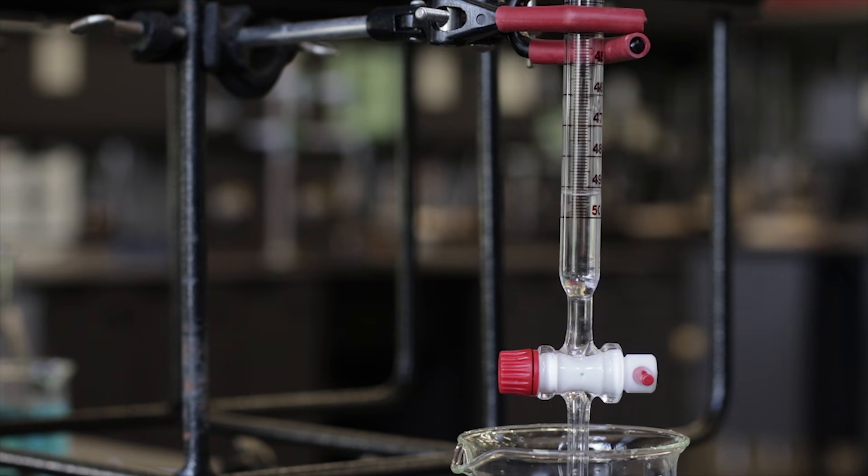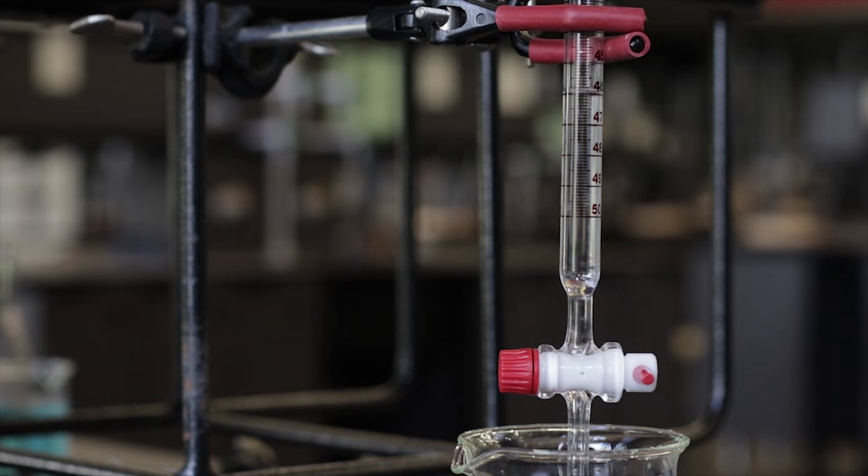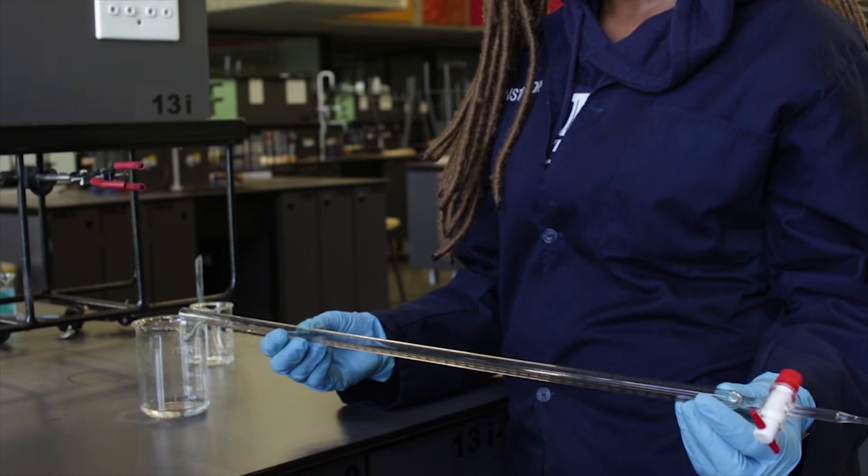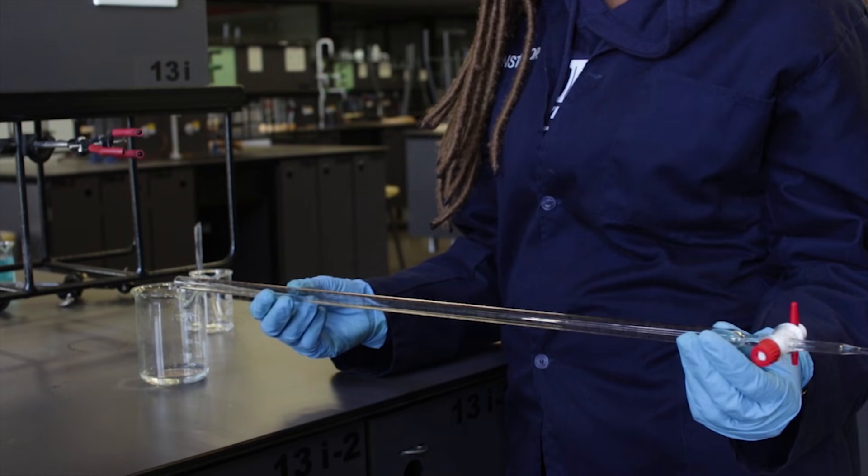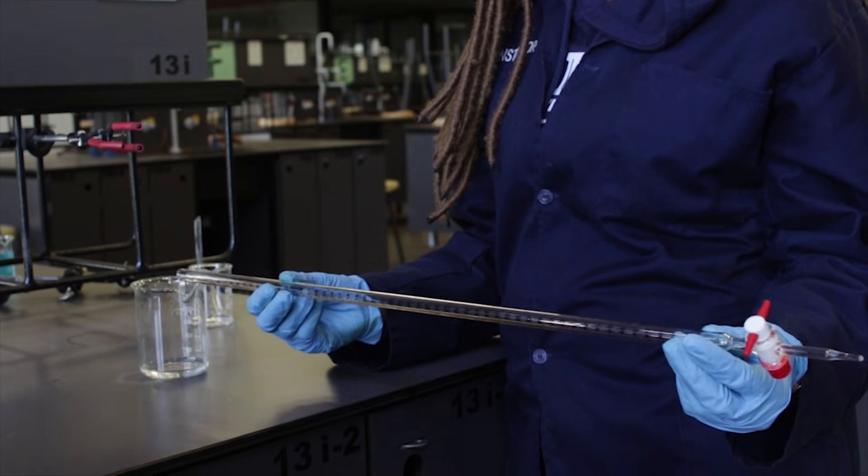This is done by adding approximately 5 milliliters of the titrant into the burette. The burette is then held down nearly horizontal with an empty or waste beaker under the open portion of the top of the burette.